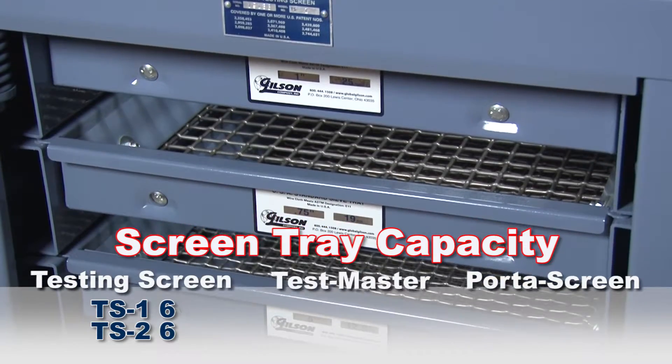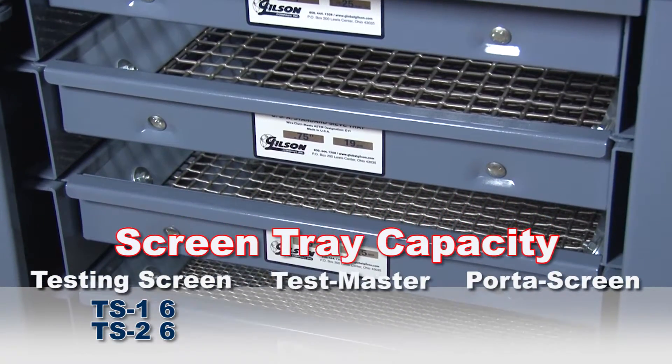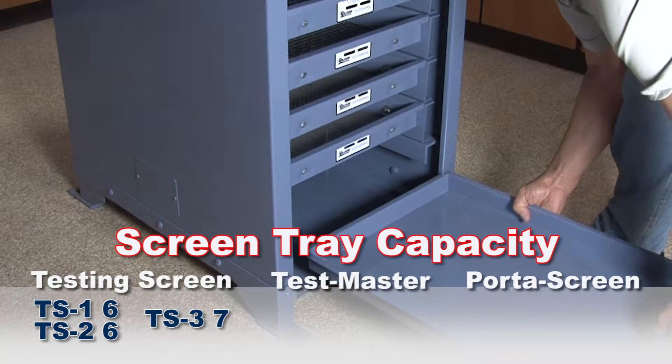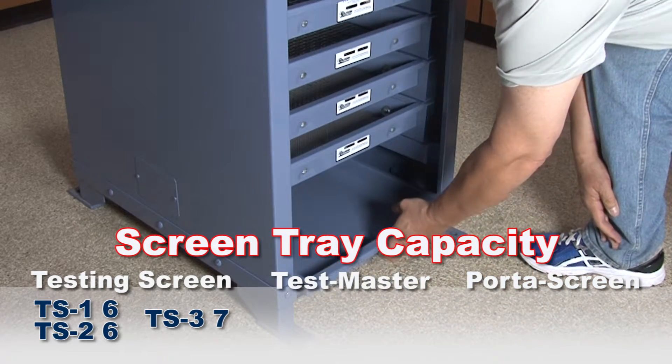The TS1 and TS2 testing screens have six mounting slots. Whereas the TS3 model has seven mounting slots, and the dustpan can be placed on the bottom shelf, freeing up one of the slots for an additional screen tray.